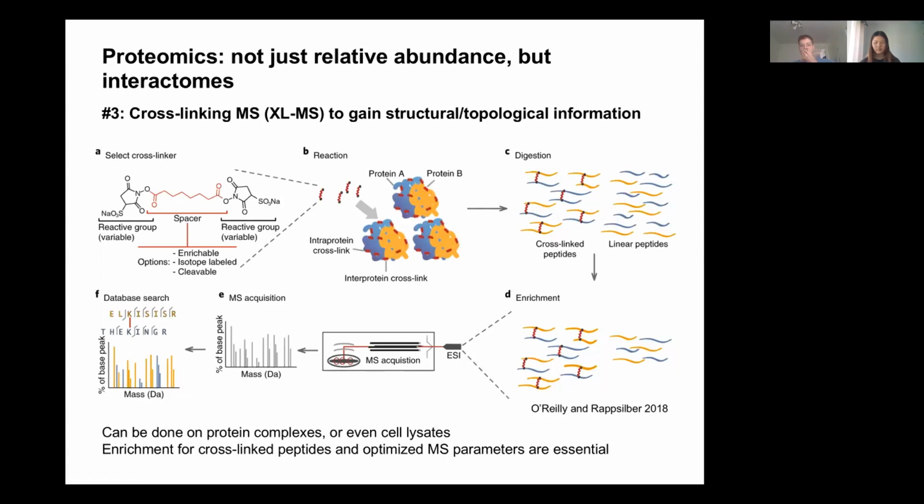Okay, the last technique that I'll bring up is to gain structural information from complex mixtures. I hope that I've expressed that you can measure pretty much anything with mass spec, and if you can have a cell lysate, you can really do anything to it and then try to compare differences later on. Now this is another layer of resolution, beyond just what is close to what.